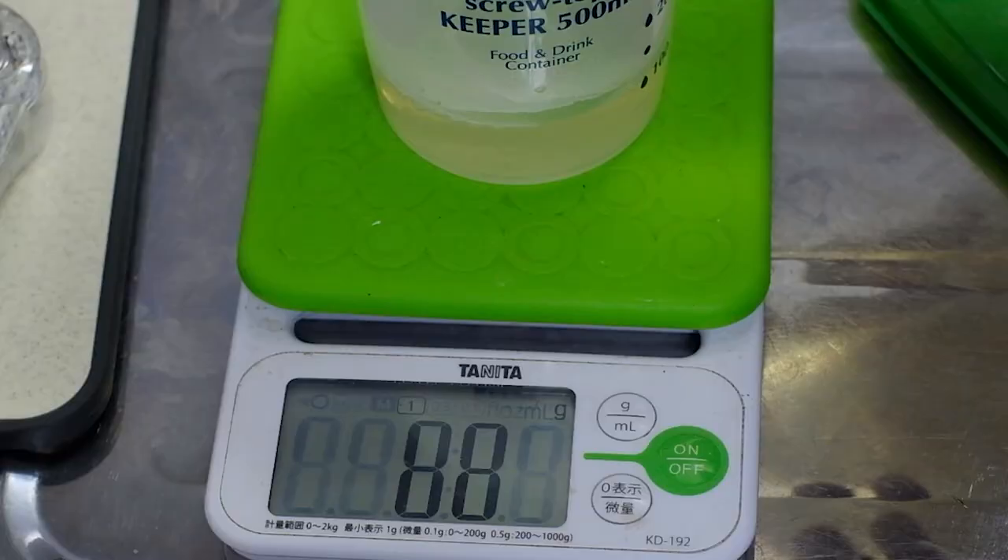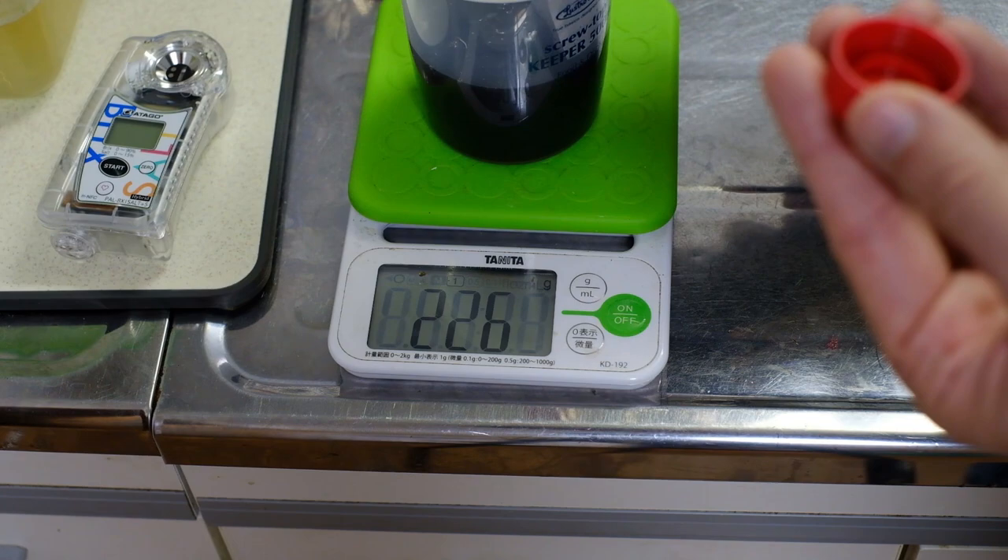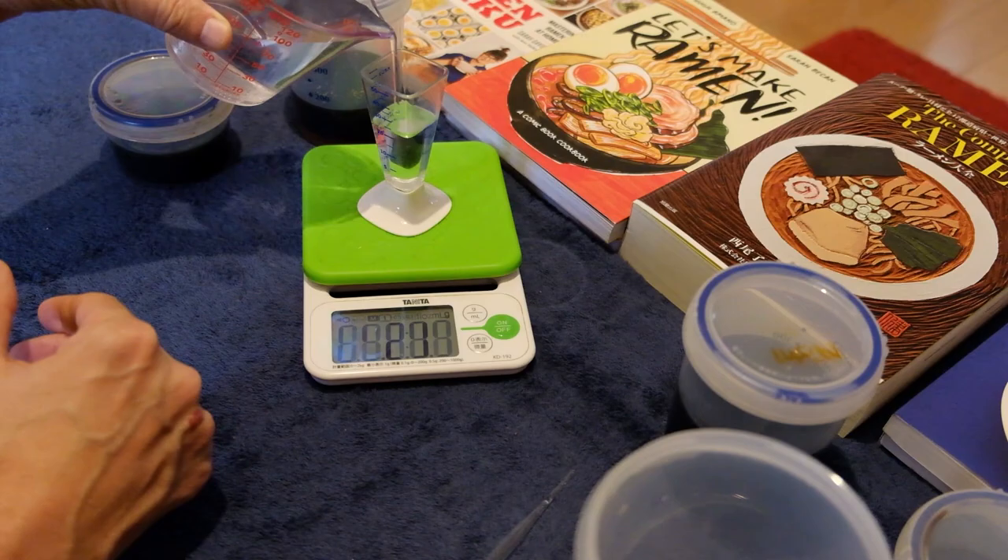Let it sit for a few minutes — that's 2 grams of katsuobushi as well. Strain it through a fine sieve or a coffee filter. Weigh out some of this liquid and add exactly 17% salt by weight. Get out a calculator and multiply the weight of the dashi by 0.17 to get that number. Finally, add equal amounts of soy sauce to this salty dashi.